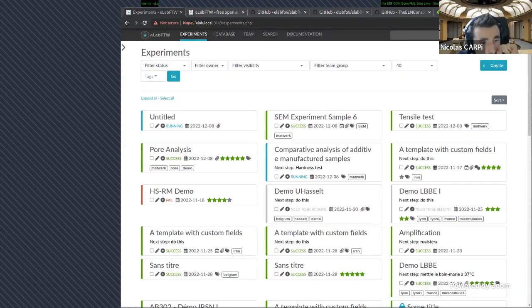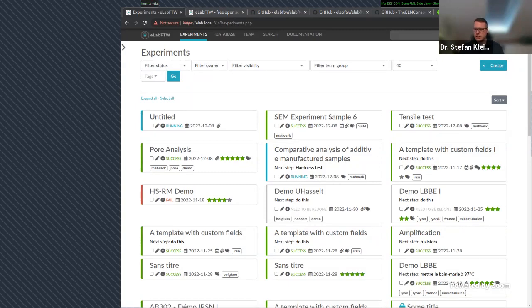Once you have defined a structure template, is it possible for the user to add additional structure information on the fly? Yes. I cannot answer for Marcus, but for me, yes, it's possible. Marcus, you can answer as well, or write it in the chat. I guess this should be possible, because at the beginning you maybe don't know exactly what you need or want to store. Yeah, sure, of course. Okay, I think we cut this discussion here.